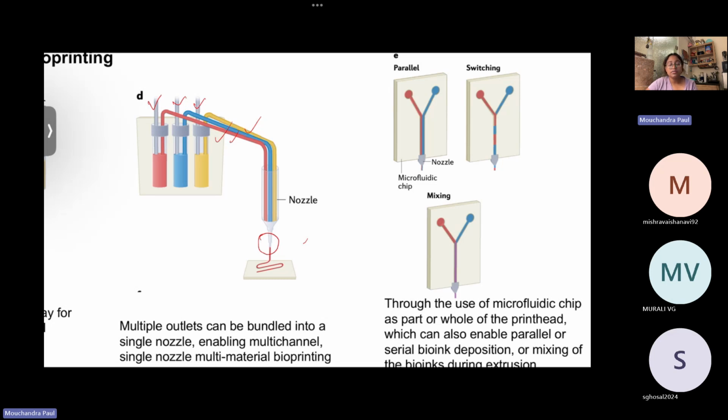that you get, the 3D structure, you can think that it is holding its shape because of the high viscous material, whereas the bioactivity of the entire structure will be based on Bioink B, which is low viscous, and cells are in between. And their viability is high now, right? The cell death is lower, so the viability is high. So when you try to mature it, it will now be able to penetrate into the 3D space further in subsequent days of culture. So that's one benefit of treating each of these components individually in this type of configuration.